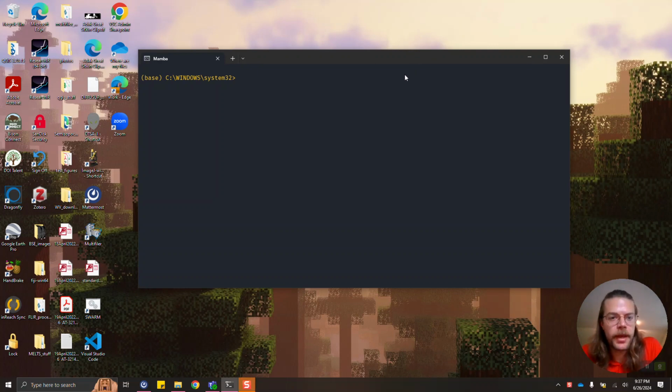Everybody, we're back with another LaserTRAM-DB video. This one's going to be a little bit shorter, and it's going to go over how to deal with normalizing a line of spots gathered in quick succession. Say you have something like a rotating aperture, or a way to generate a bunch of spots that are gathered in succession rapidly enough that you don't really come down to background, and you can't parse those out into individual files. Or the instrument doesn't parse them out into individual files.